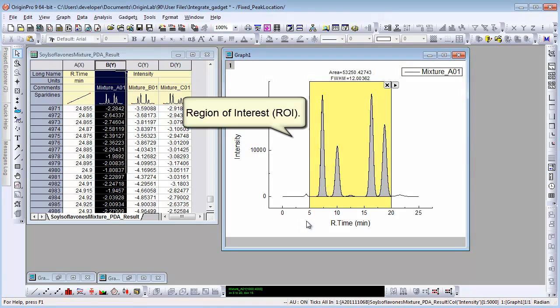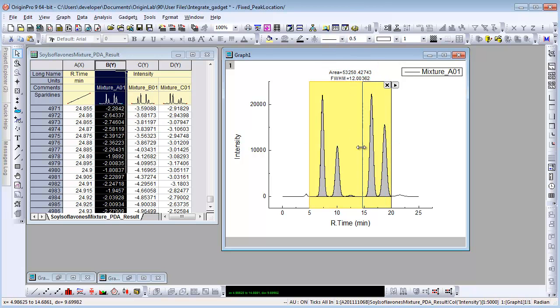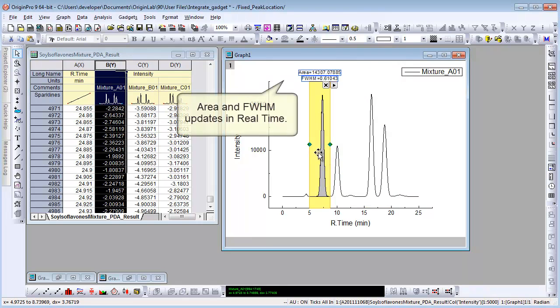Let's click OK directly for now. A yellow rectangle shows, we call it ROI box, region of interest. Area and FWHM of this region shows on the top. When resizing or moving the box, the calculation will update in real-time.